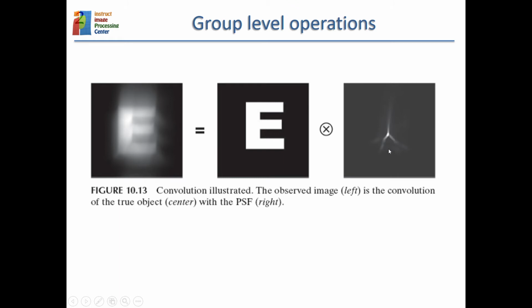And the same happens in this downwards direction, to the right, down, to the left. So we have multiple copies in each one of them. So the true shape of the point spread function, so this kernel is called the point spread function in optics, and the true shape for the electron microscope is something round. So it looks like a kind of Gaussian, if you want. It is not a Gaussian, but if you want to think of it as a Gaussian, and then you are moving the ideal image in all directions.